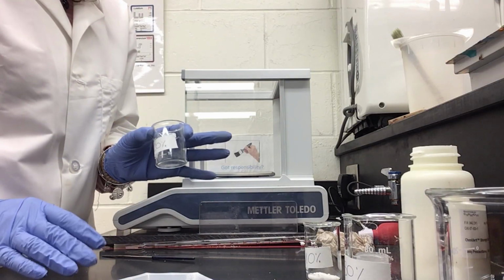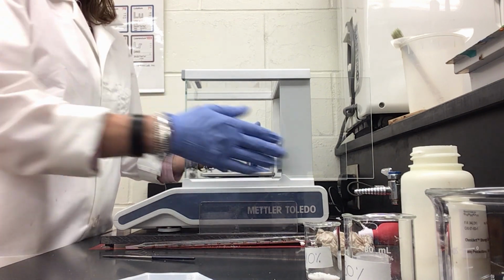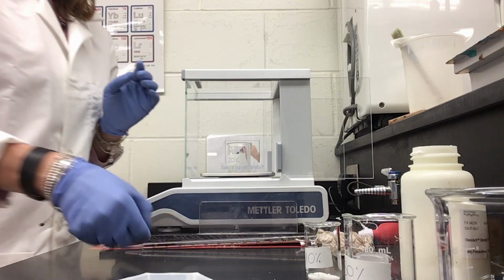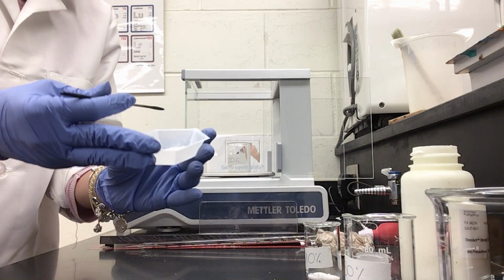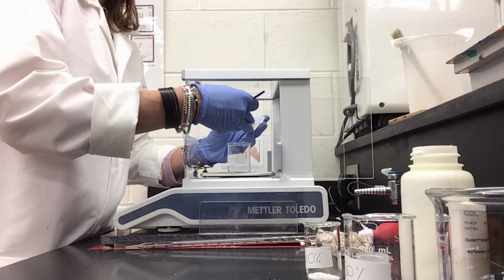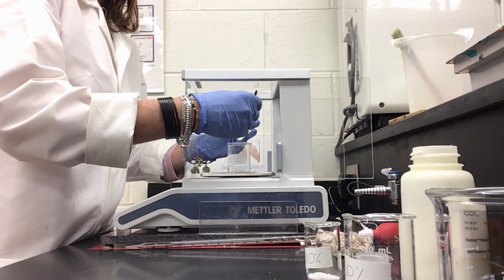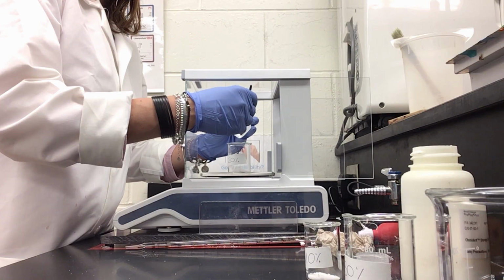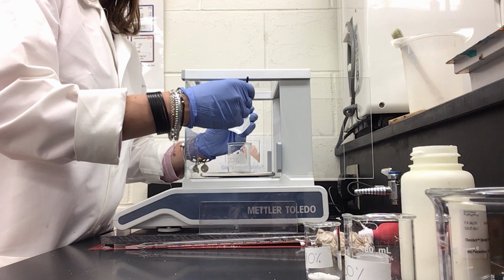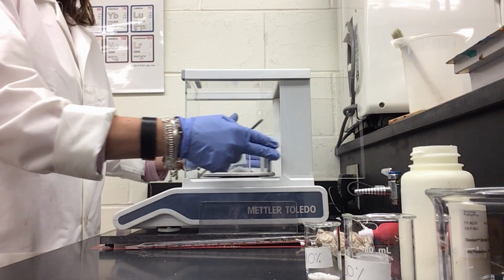So we need to weigh 3 grams of sugar. You open, you put the beaker inside, you close, and you zero. Now you reopen, you take the spatula with one hand, the weigh boat with the other, and you go on the other side so that you can work it well. And now you drop until you reach maybe 2.8, and when you are at 2.8 you start dropping slowly because you don't want to go over 3. So now I am at 2.982, 2.993, and then I close.